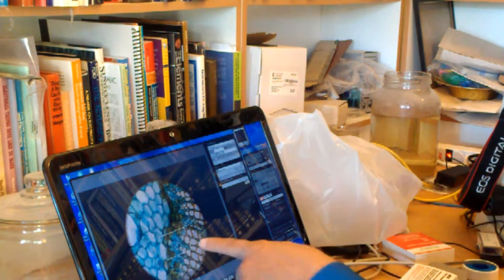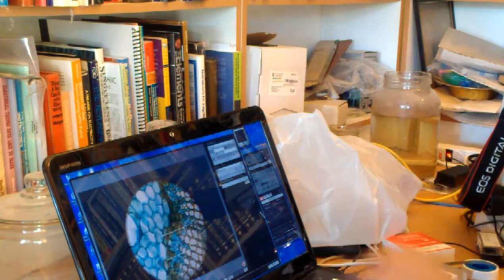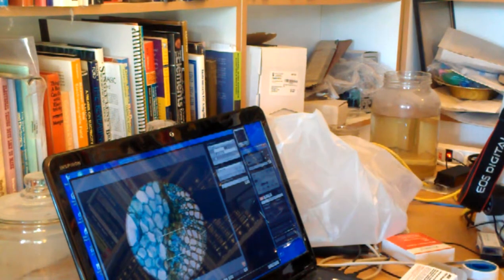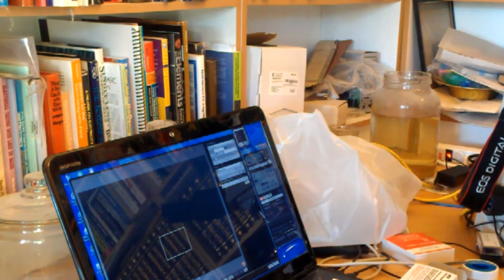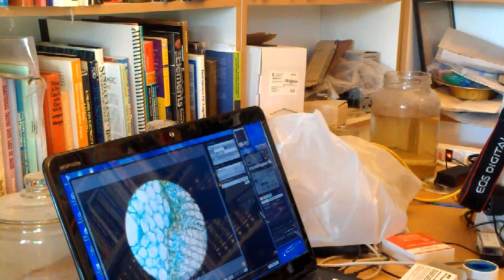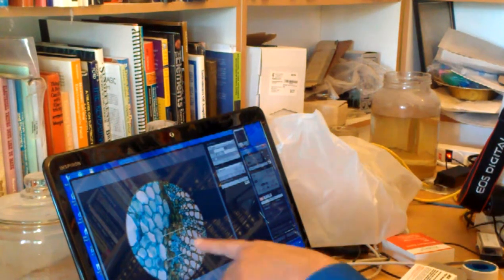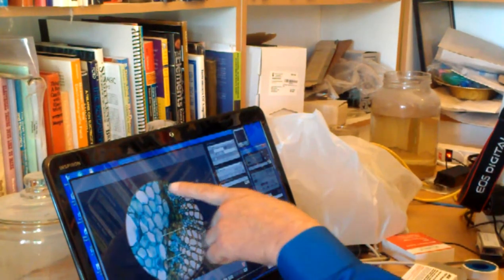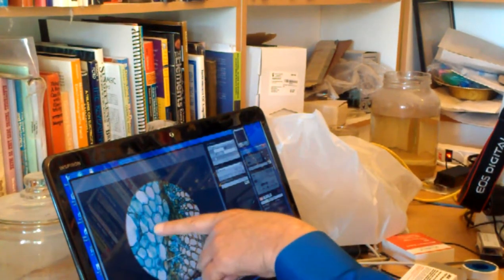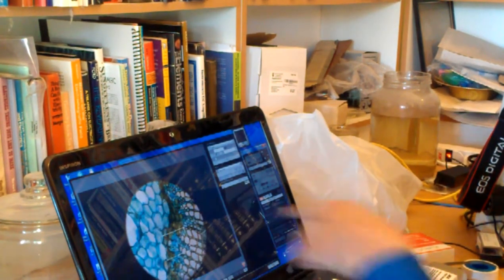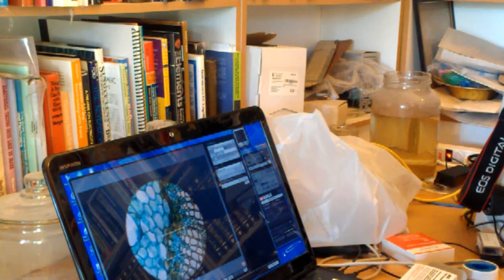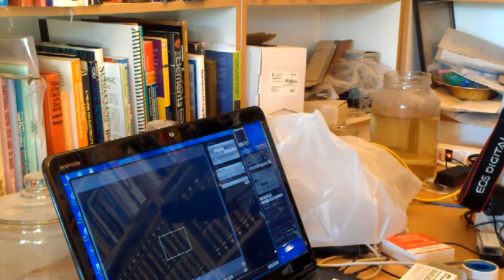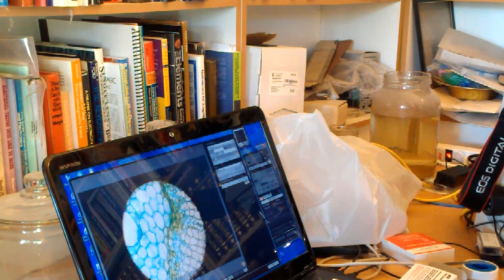So this little X down here—let's see if we could see any detail there. We can see a little bit. We can see some of these stripes in here, but now look at them show up a little better with phase contrast.